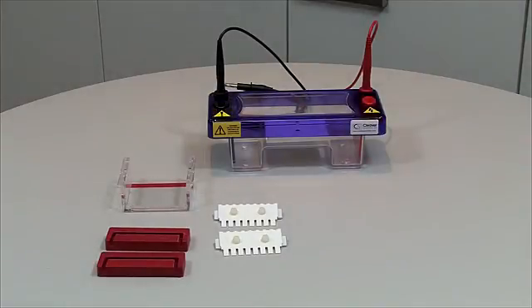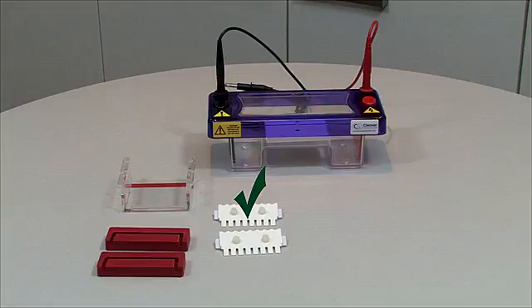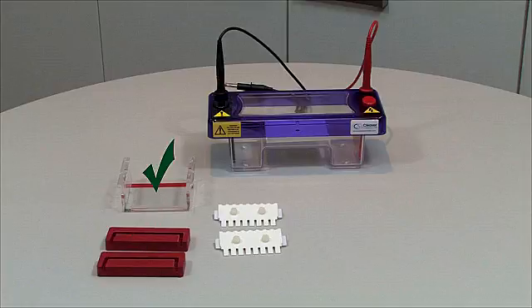This is what you will need: MS mini tank and lid with cables, combs, casting dams and gel tray with red tape on underside.